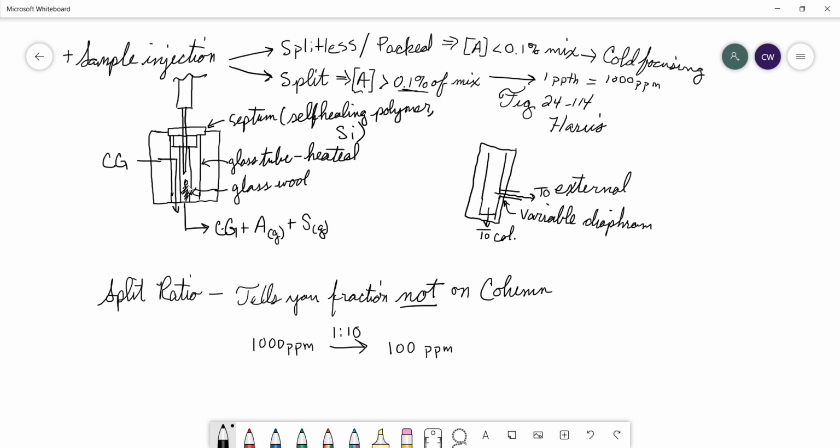If there has been some liquid that needs time to evaporate in here, that would give you a tailing peak. Cold focusing allows us to stop the stuff that was immediately vaporized from advancing to wait for the stuff that had to evaporate, so that we keep most of our analyte packed together.